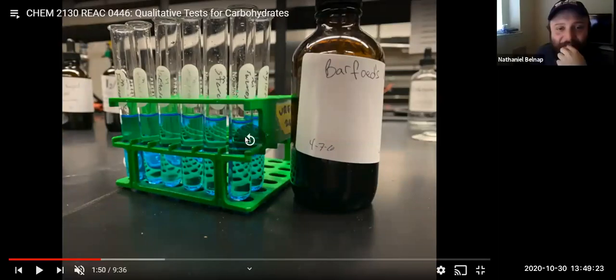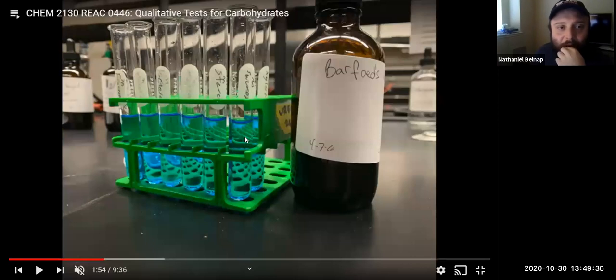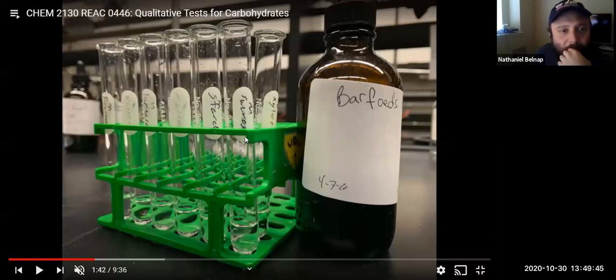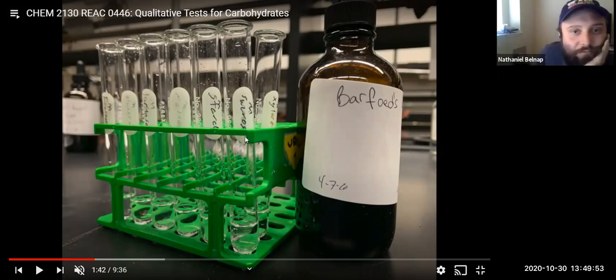All right, so we see here that we added 3 mils of the BARFOED'S reagent to 1 mil of the test tube and placed the test tube in boiling water for 5 minutes. I think he says what the list is. Looks like it says fructose, glucose, lactose, maltose, starch, sucrose, and xylose.